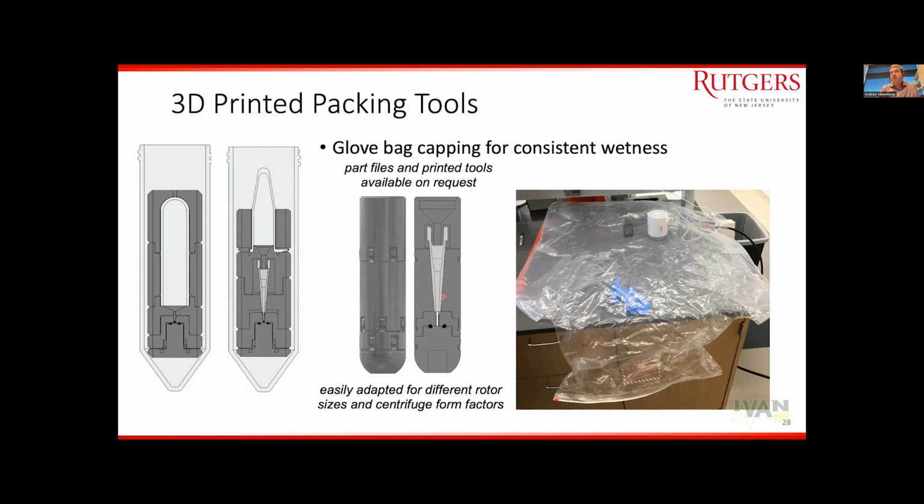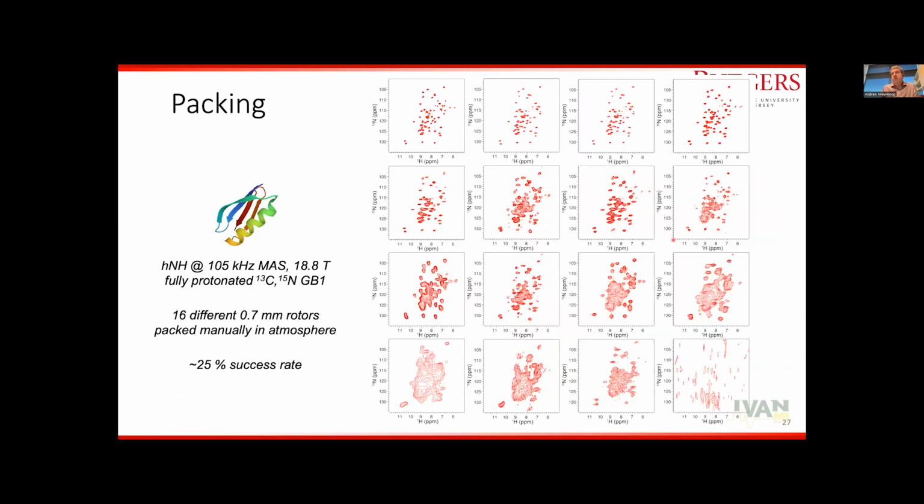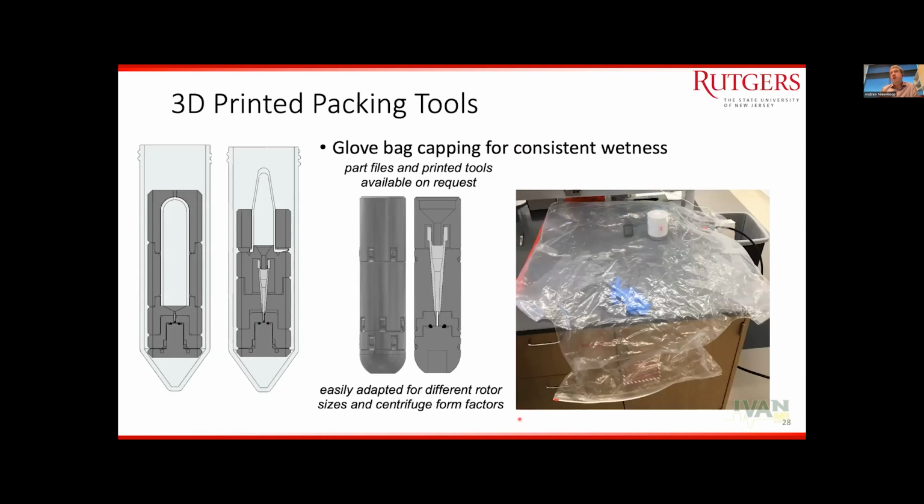This will go directly into the ultracentrifuge. You put your liposome up here, and it spins directly into the rotor. Then we transfer this material in a humidity controlled chamber to keep our water from baking off. The idea is that we maybe got 4 out of 16 rotors right before, and we're 2 for 2 so far with GB1 since. So N is not huge, but these rotors cost a lot of money, and once you get a good one, you tend not to pack a bunch more.